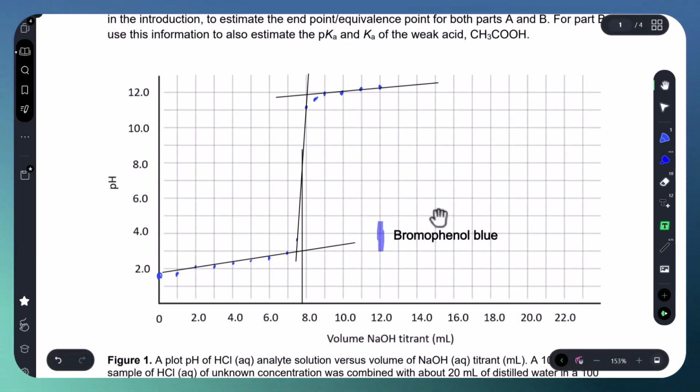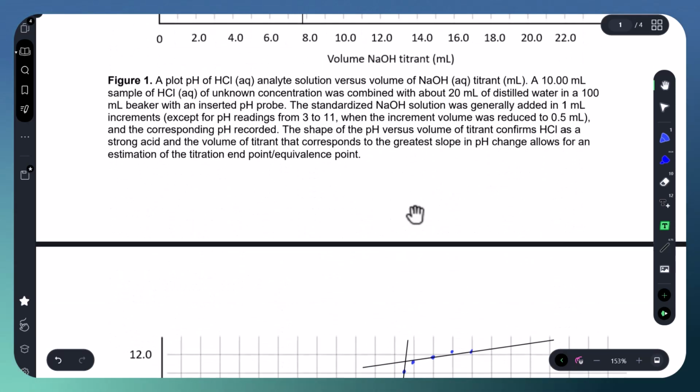And what I think you'll find is that these ranges of pH change will match the pH range of drastic change in pH. So it should be that for a strong acid, strong base titration, any one of those 3 indicators would work quite adequately to be able to determine or make an estimation of the experimental endpoint, because they will be changing color just during this drastic change in pH. However, let's look at the next graph here.